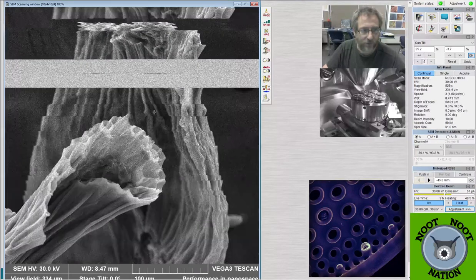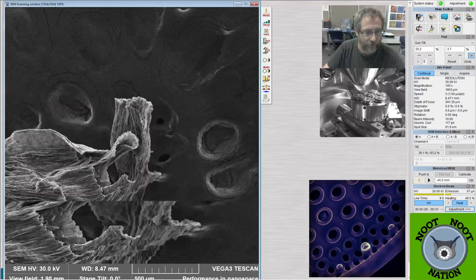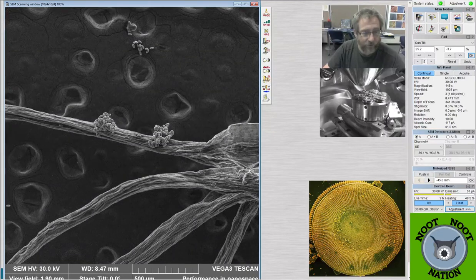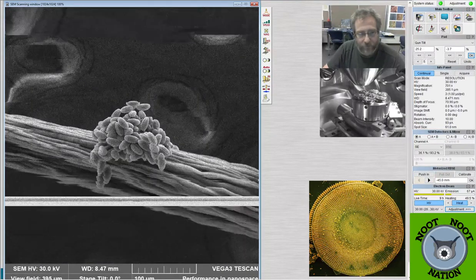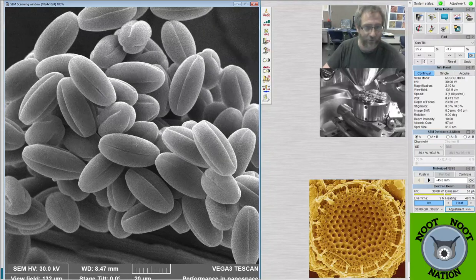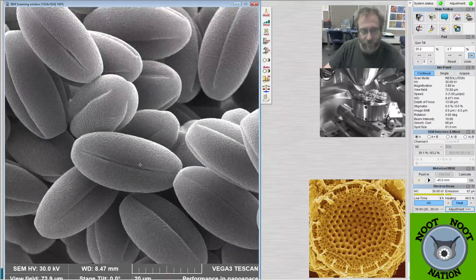But you can see here's some examples of the redbud plant itself. And these are the pollen grains that we were looking at right here. I'm pretty sure it's redbud. It's a red-colored tree. And also, I ran it through iNaturalist. If you don't use iNaturalist, you might consider downloading it as an app. It's pretty cool. I've been using it for several years now.